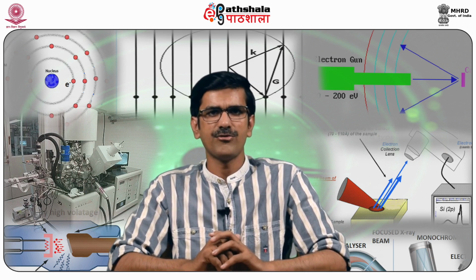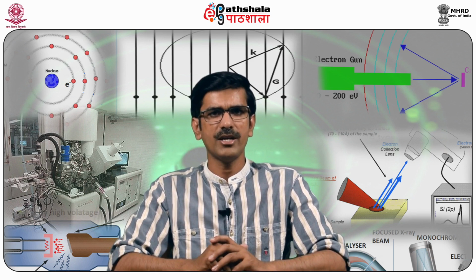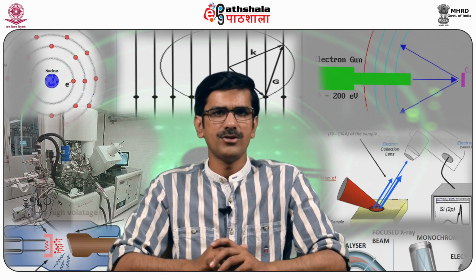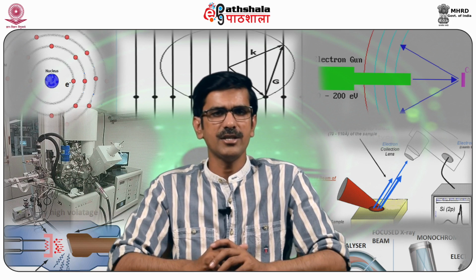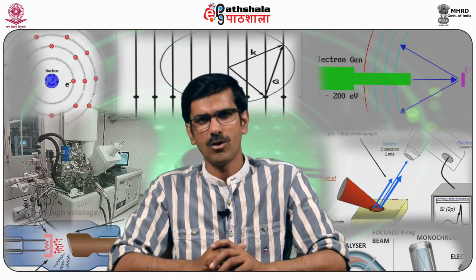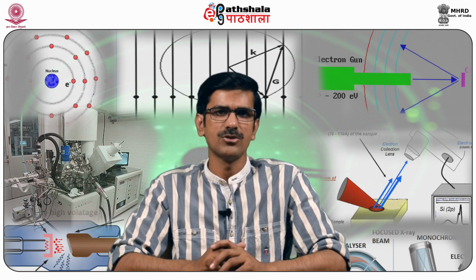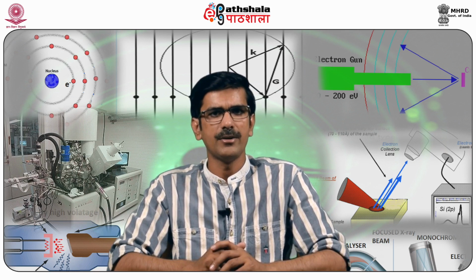It provides some of the most detailed quantitative information about the electronic structure of organic and inorganic molecules. Underneath the banner of PES, there are two separate techniques for quantitative and qualitative measurements. One is ultraviolet photoelectron spectroscopy, that is UPS, and the other is X-ray photoelectron spectroscopy, called XPS. UPS focuses on ionization of valence electrons, while XPS is able to go a step further and ionizes core electrons and pry them away.